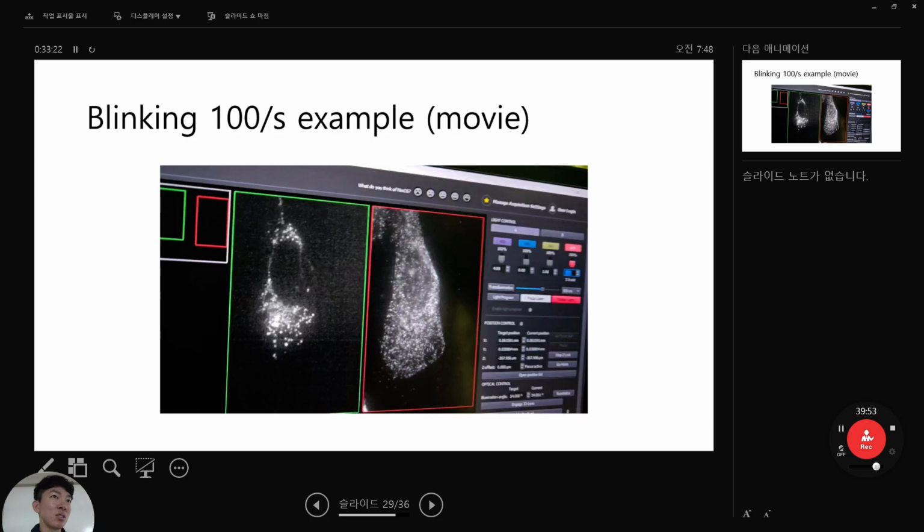So when you do some co-localization of the proteins, you turn on these two, but when you excite this one, the other is brighter, which means that turning on the red and only exciting this one, this one is also excited. Okay. Thank you.